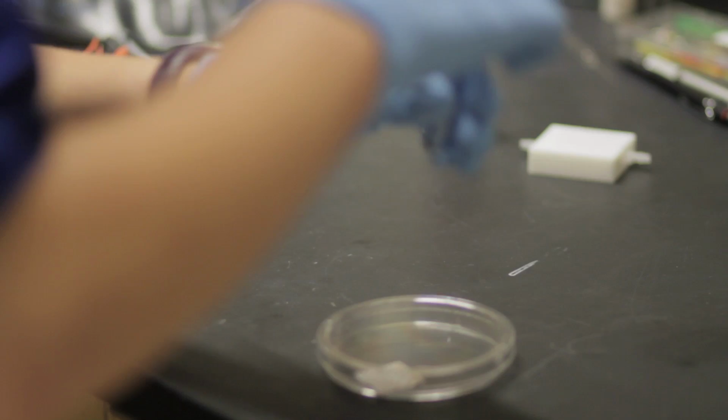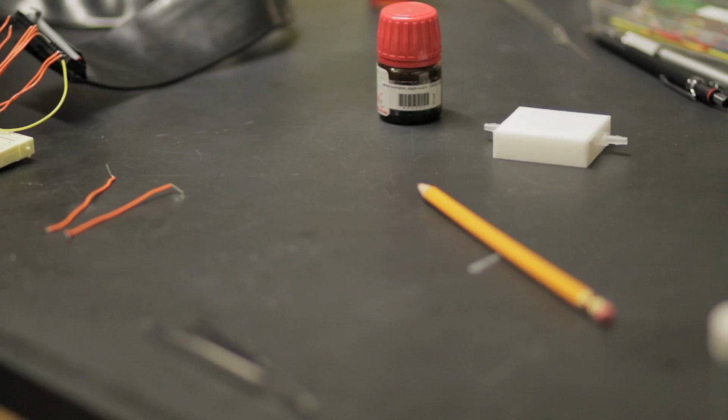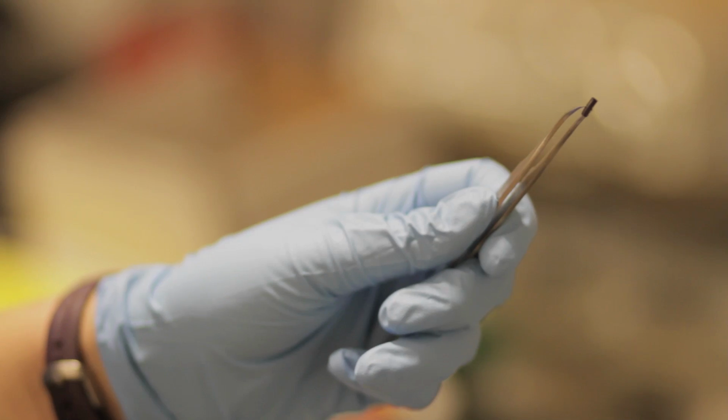Our approach for overcoming the challenges of working with carbon nanotubes relies on a solvent-free method that is essentially similar to drawing with pencil on paper. Instead of using a graphite-based lead like a regular pencil, we make our own lead that's composed of carbon nanotubes. To make our pencil lead, we take a commercial powder of carbon nanotubes and compress it into the shape of a lead using a press.